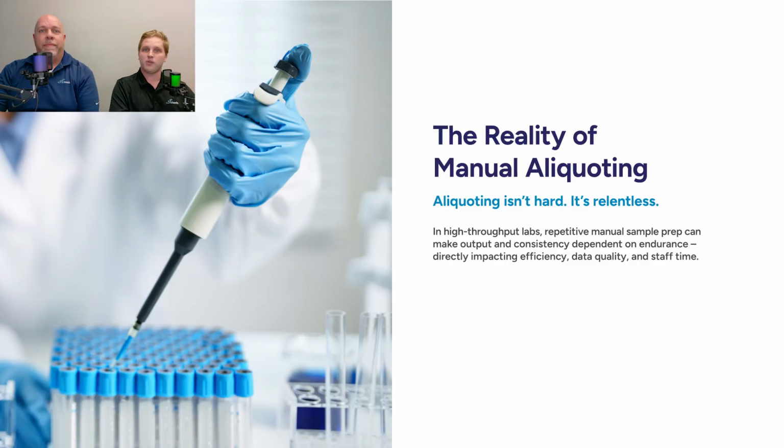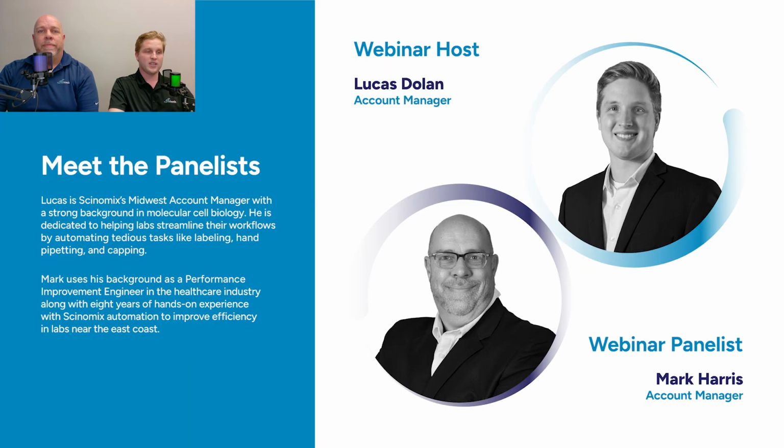Today we're going to be talking about the reality of manual aliquoting. So aliquoting and pipetting in general isn't hard, but it's relentless, right? It's going to be that repetitive strain of doing the same thing over and over, and that's kind of what we're going to be talking about today.